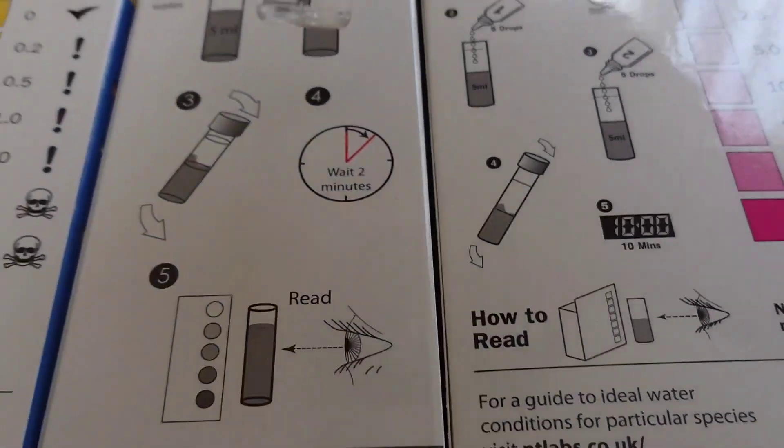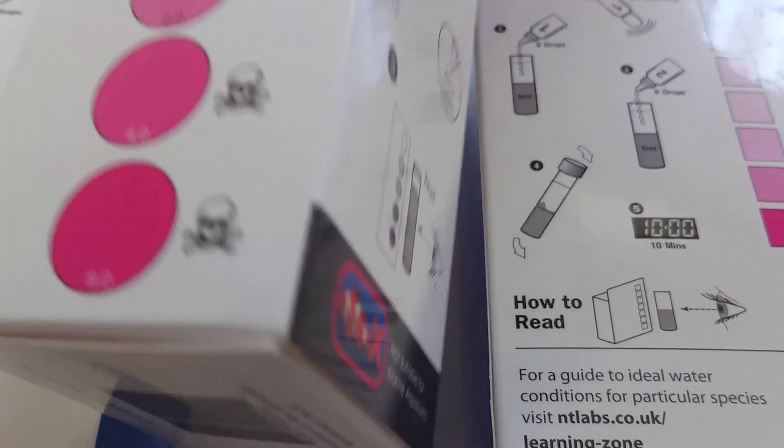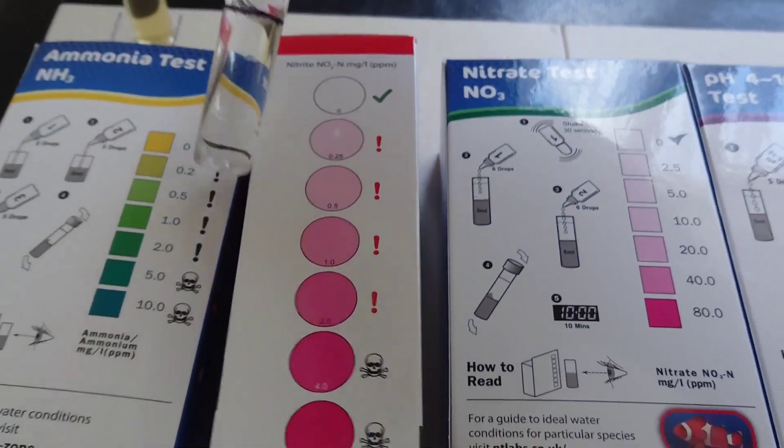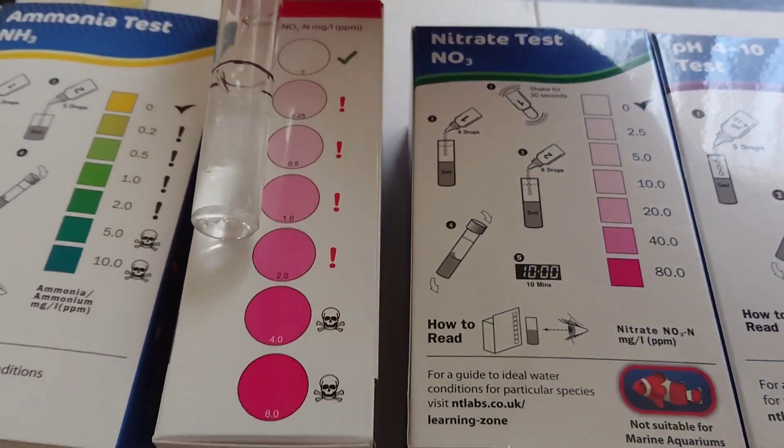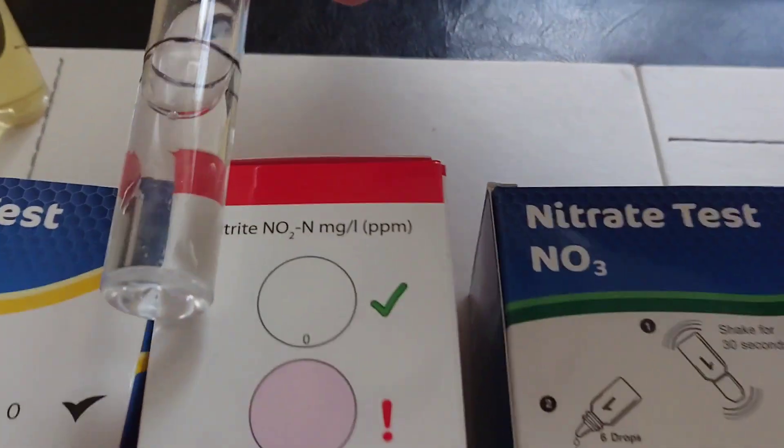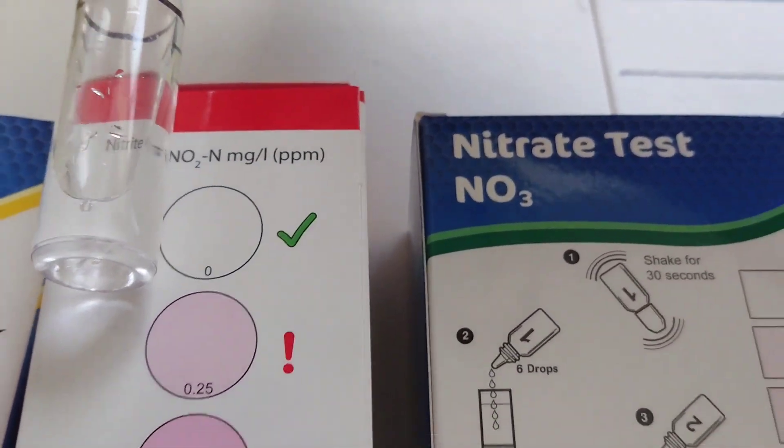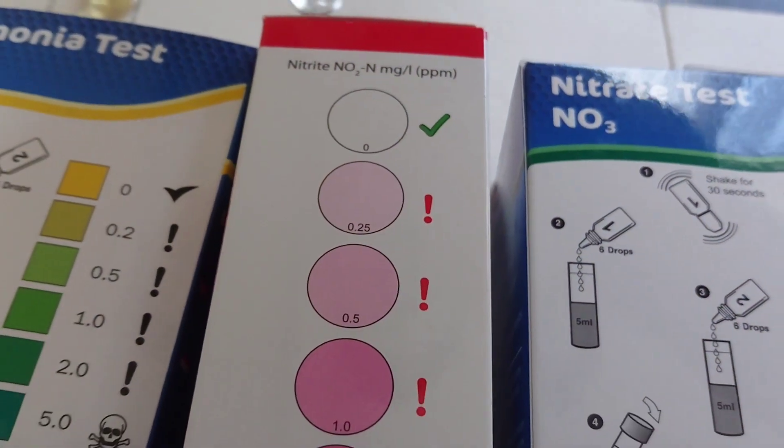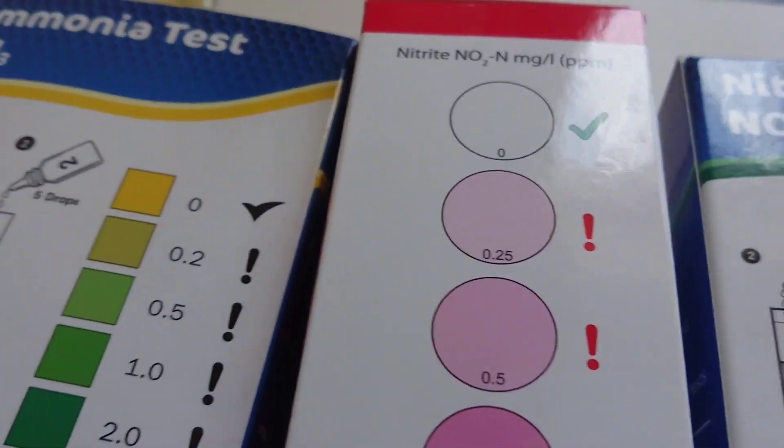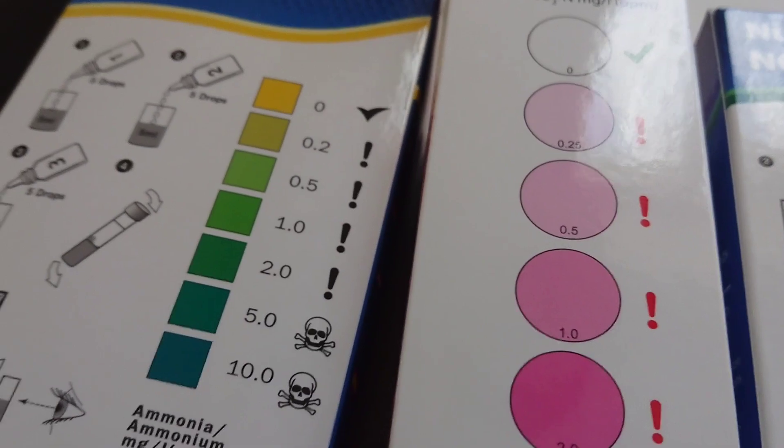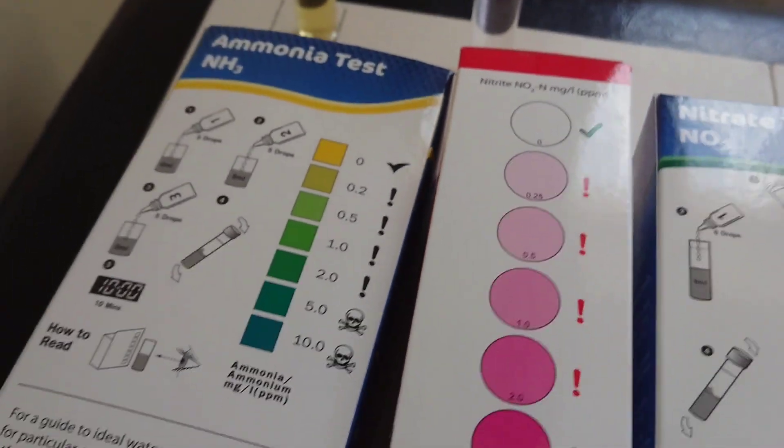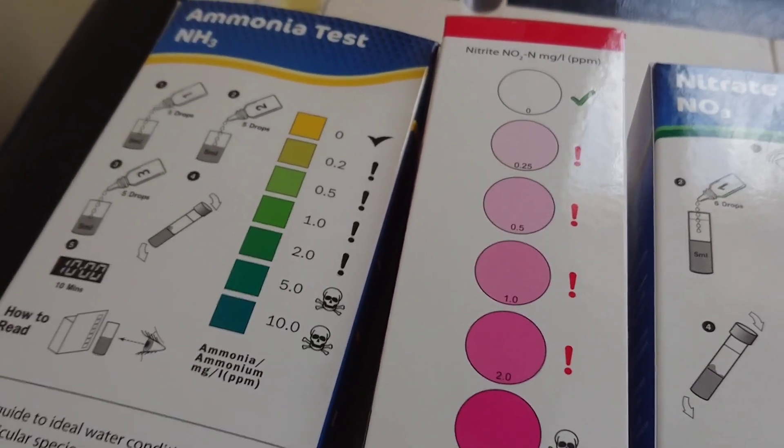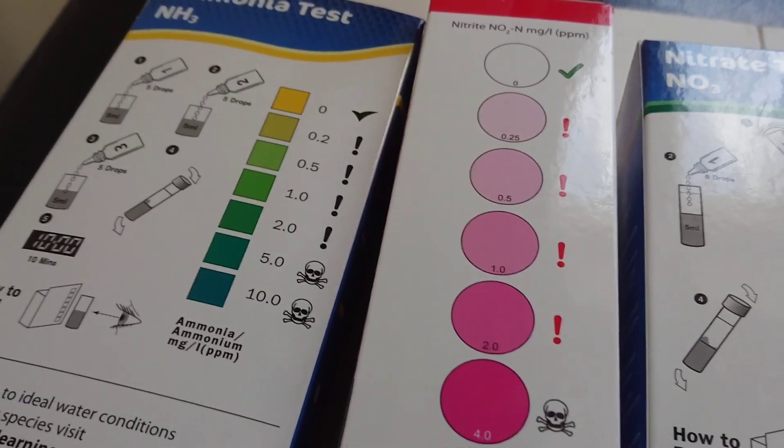Next we got nitrite: also zero, which is what you want in a cycled tank. If you're showing any high amount of either of these, then your tank isn't cycled yet and you shouldn't really be having fish in them.